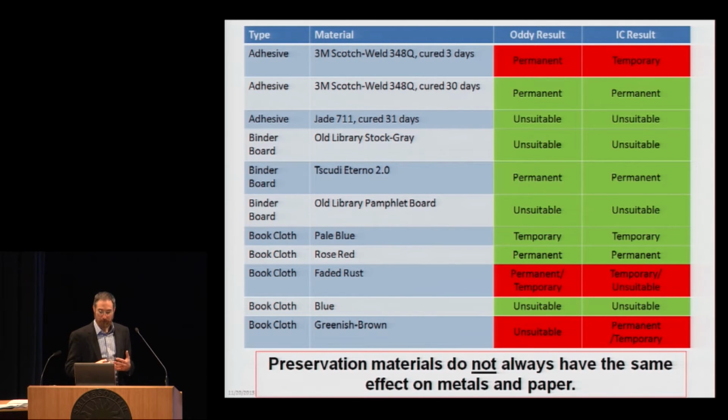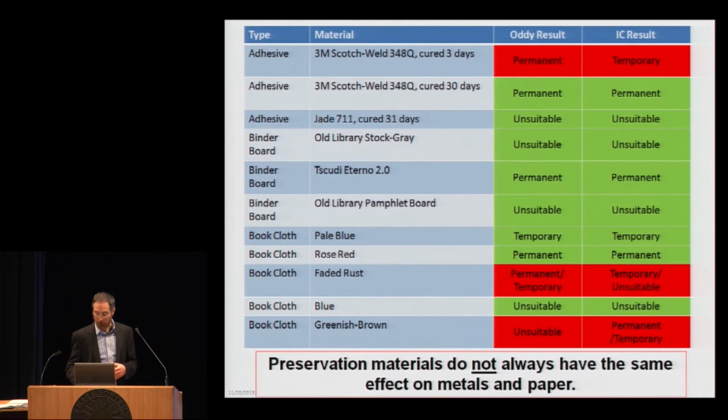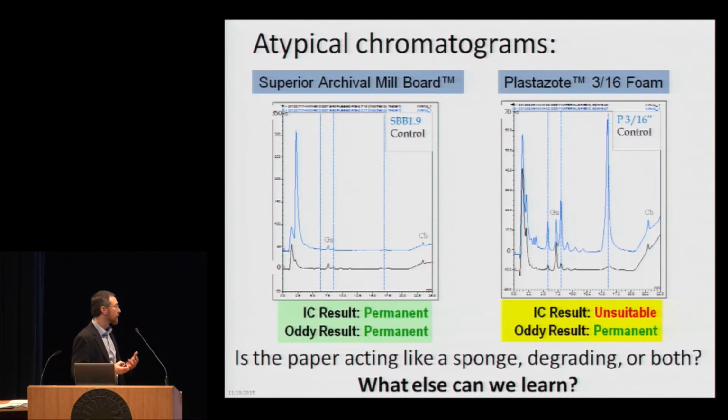So to answer that question, do preservation materials have the same effect on paper or organic materials as metals? The answer is probably not. Out of that set of materials that I looked at, 20% of them turned out to give a different result. So the ones in red here are a couple of examples of things that gave different results with the Oddy test and the IC test. I hope to expand this list and repeat all of these to really verify how significant an effect this is. But even with one, it's enough to say, well, maybe we should be looking at this issue.